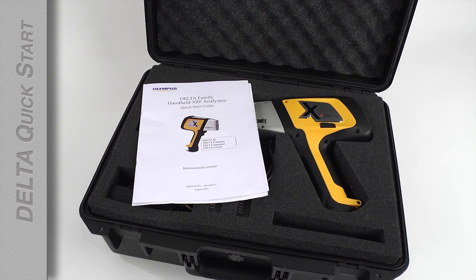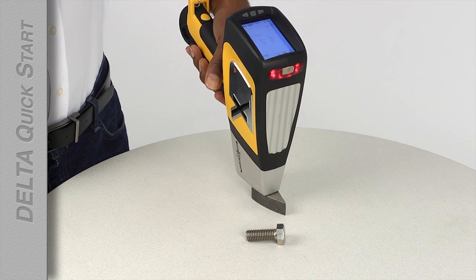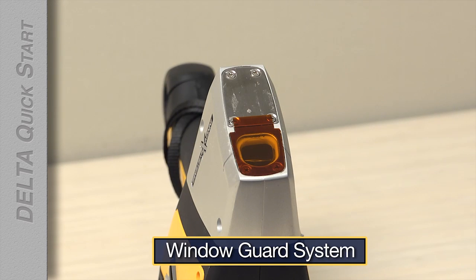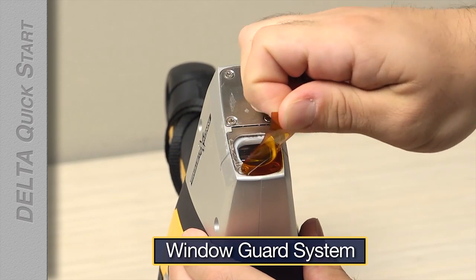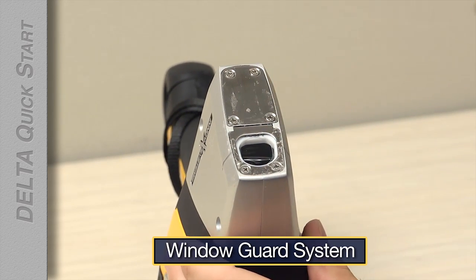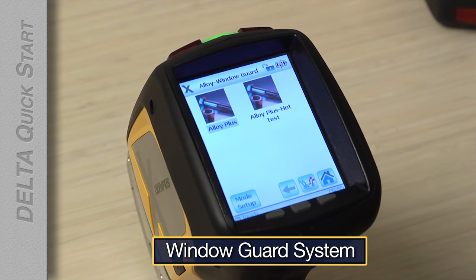Once CalCheck is done, your analyzer is ready to use. Your analyzer has been configured to your specifications. The Delta in this video has been configured for metal alloy identification, so we are going to test some metal. Deltas with an alloy calibration will have the window guard system installed. For premium and professional models capable of testing lighter elements, you must remove the window guard window and change your mode to Alloy Plus to test for these elements.